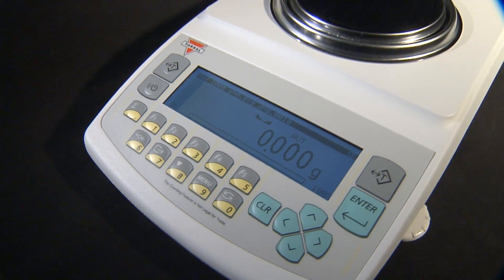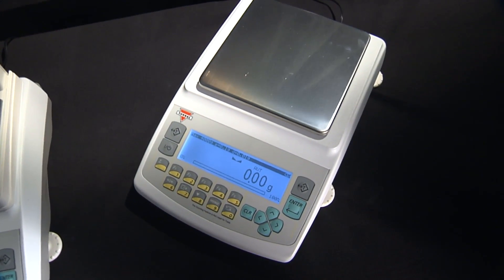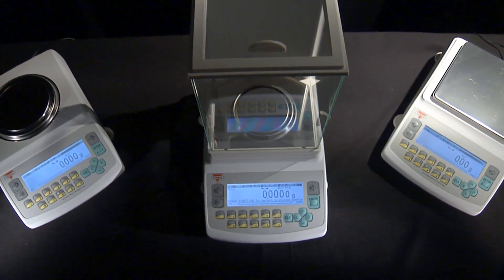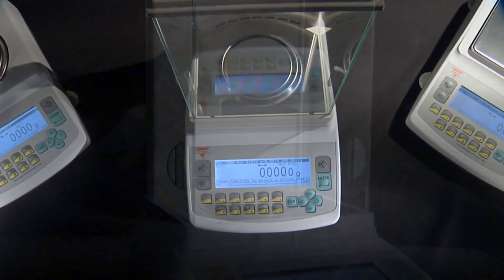The series includes models ranging in capacity from 100 to 500 grams with a resolution of 1 milligram, and 1,000 to 4,000 grams with a resolution of 0.01 grams. The AG professional analytical balance, which offers a resolution of 0.1 milligram, is available in 100 and 200 gram capacities.